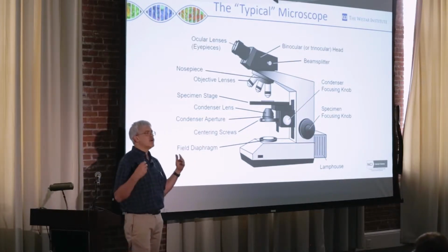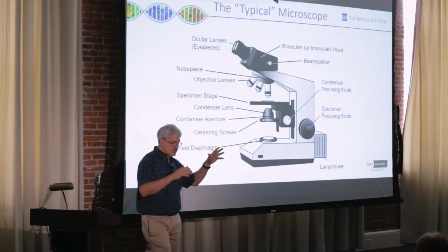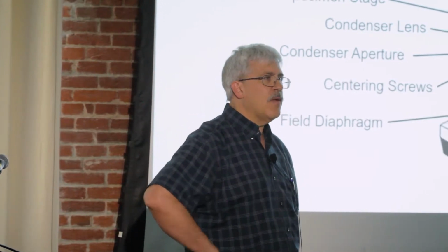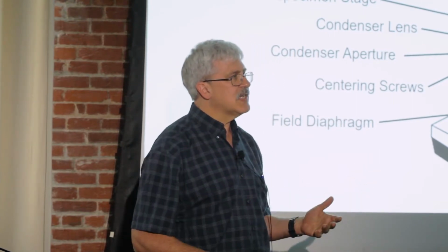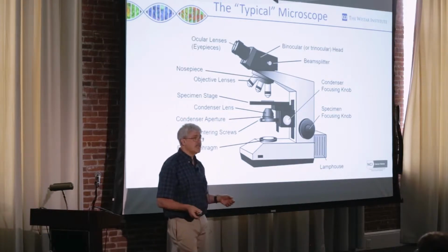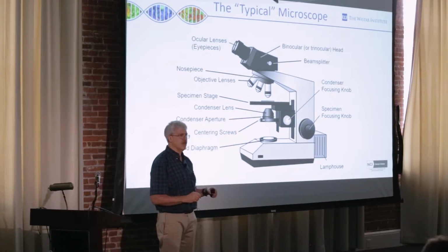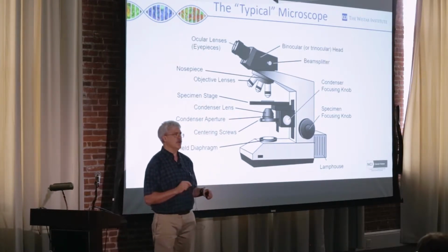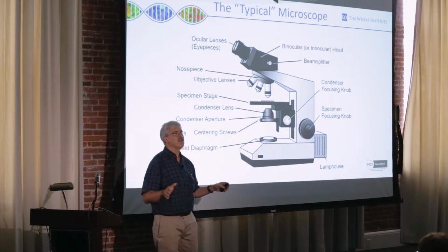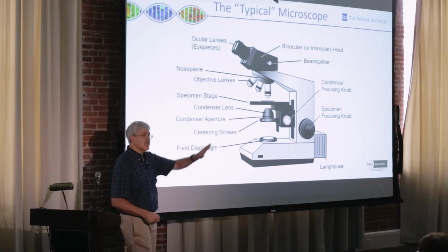We have different options. One of the reasons that I'm doing all this is you have to understand what all the basic parts are, and then you sit down at a microscope and say, oh, where is that beam splitter? And you can kind of figure it out based on taking a look at things. So as a for instance, in the upright scopes, it's going to be fairly straightforward. It's going to be a little slider about there that comes out. But on the DMI-8, hey, guess what? You got to push your finger on the little LCD screen in front and look for the software interface and push it there. So it doesn't really matter where it is. You just need to know, oh, I need to find the beam splitter. All right. So that's the point, though. If you don't see anything through the eyepieces, but you see it on the camera, you got it.